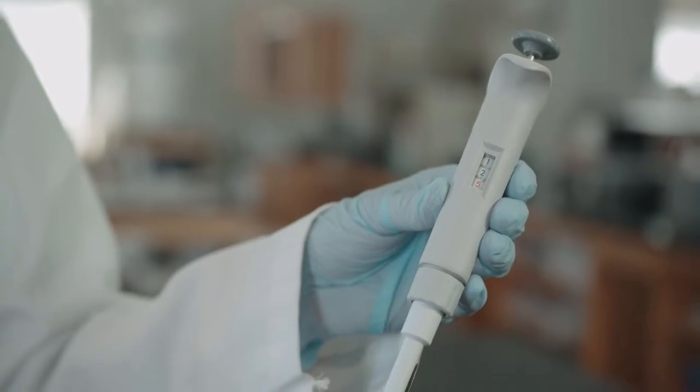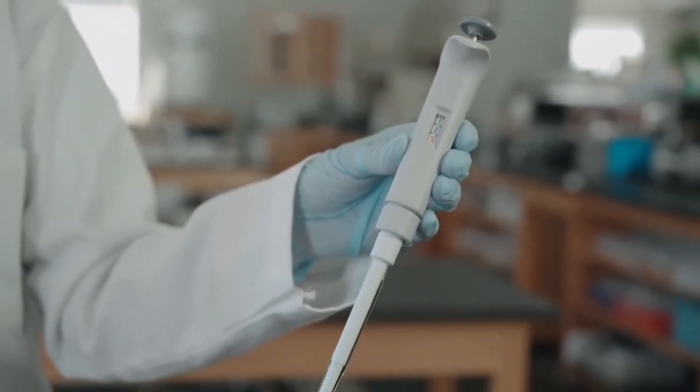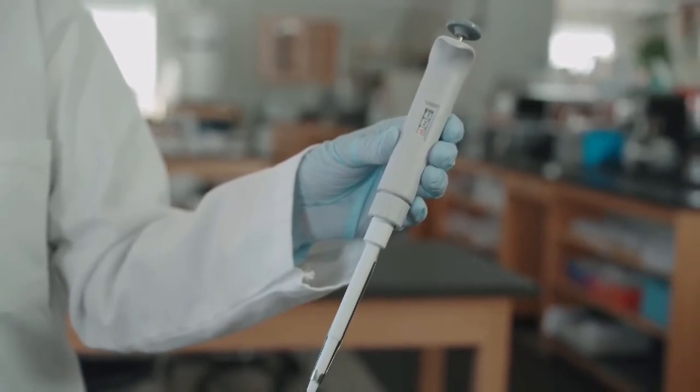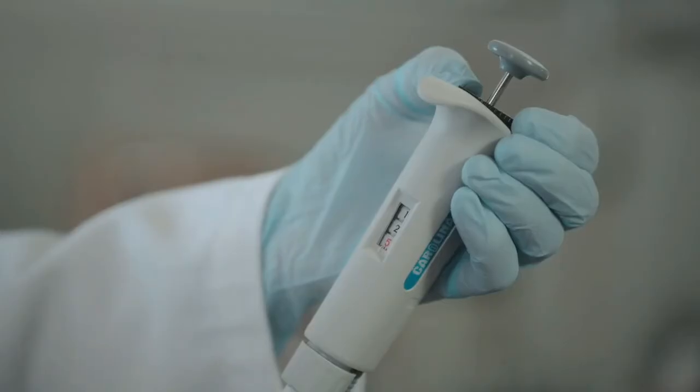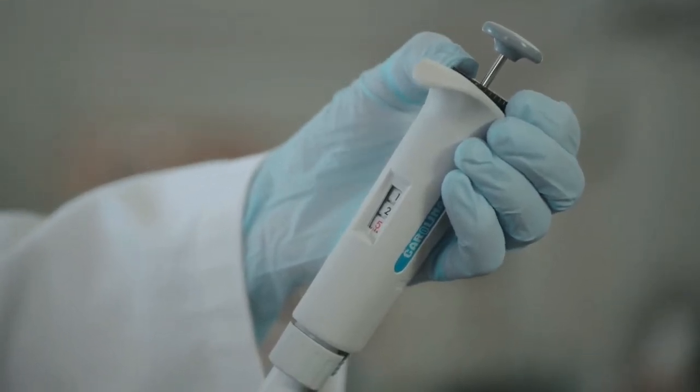We will use the P20 micropipette to demonstrate how to use a micropipette. However, the principles learned with respect to this pipette generally apply to other types as well. Different micropipettes have different but similar mechanisms for setting the volume they will take up.